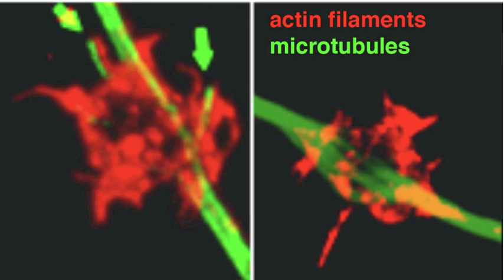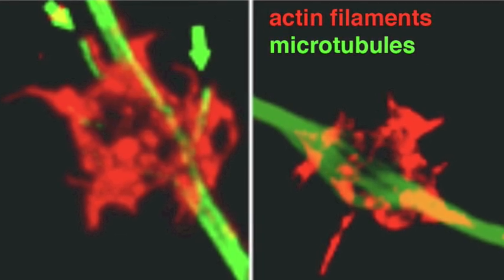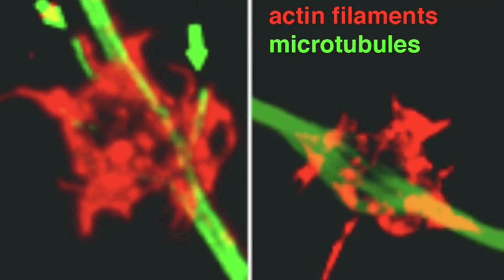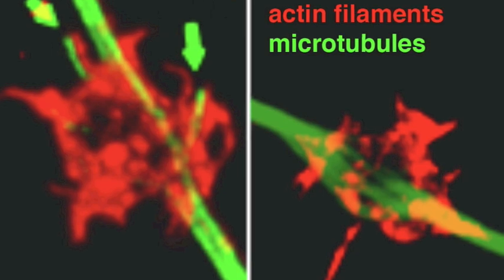When an NGF bead lands on an axon, a new growth cone is induced at the contact site and a branch sprouts from the axon.